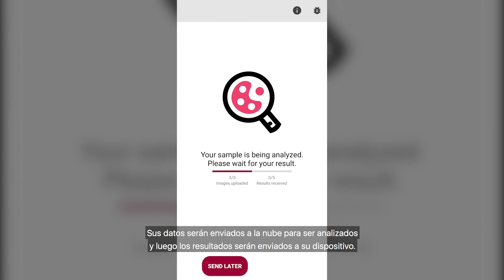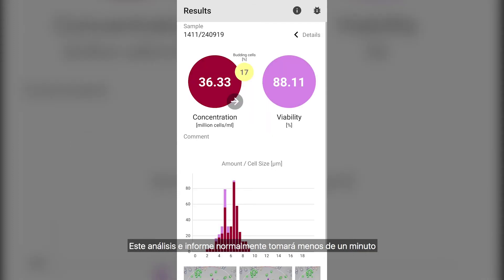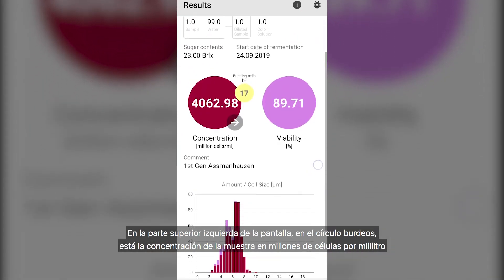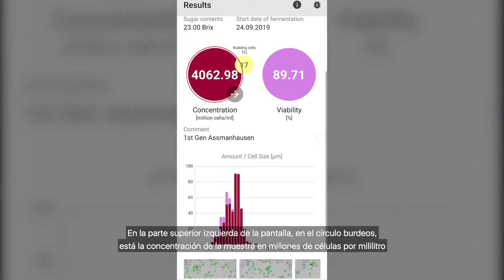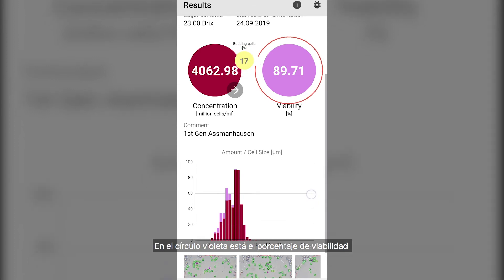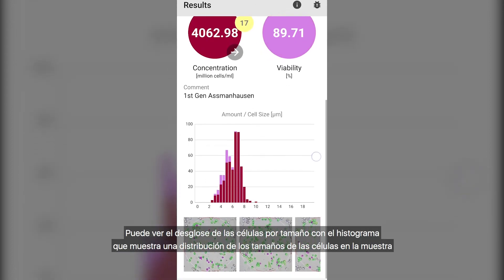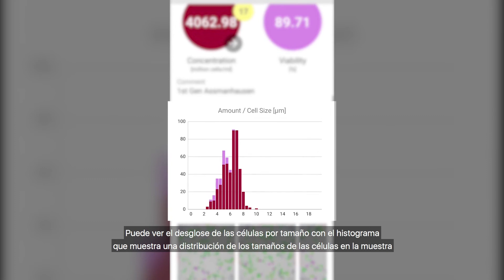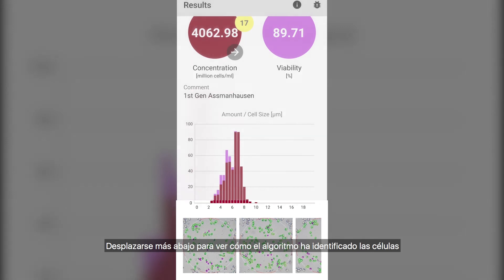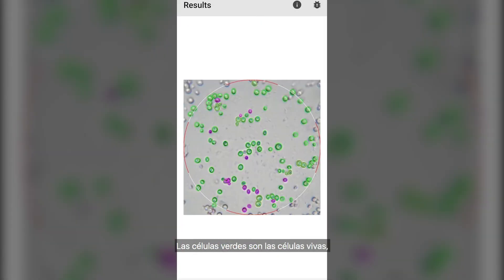Your results will then be sent to the cloud for analysis, with the results being sent back to your device. This analysis and reporting will normally take less than a minute. The results of the analysis are easy to follow. On the top left of the screen, in the burgundy circle, is the concentration of the sample in million cells per milliliter. In the tiny yellow circle is the percentage of cells that are budding. In the violet circle is the viability percentage. You can view the breakdown of the cells by size with the histogram showing a distribution of cell sizes in the sample. The burgundy bars indicate live cells and the violet bars stacked on top show the distribution of dead cells. Scroll down further and you can see how the algorithm has identified the cells — green cells are living, violet cells are dead, and yellow indicates budding cells.